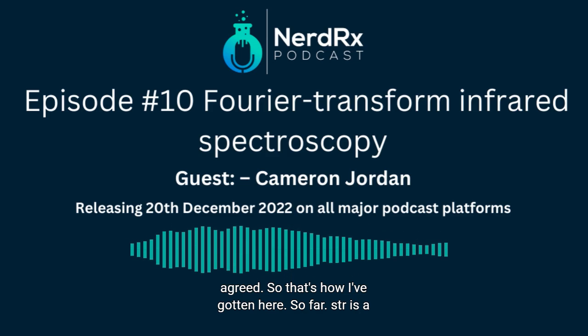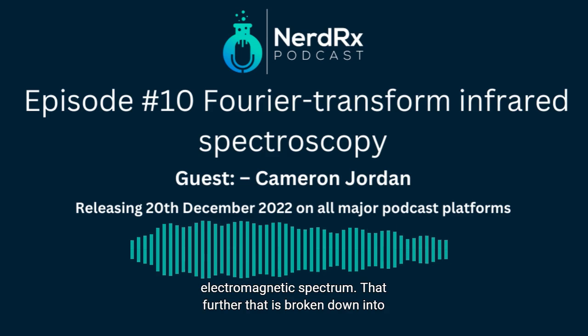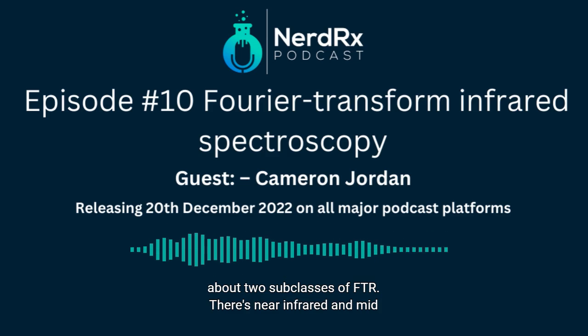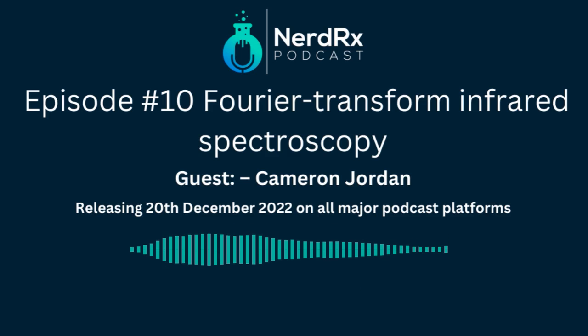FTIR is a spectroscopic method that uses the infrared portion of the electromagnetic spectrum. That is further broken down into about two subclasses of FTIR. There's near infrared and mid infrared. They just utilize different regions of the spectrum.